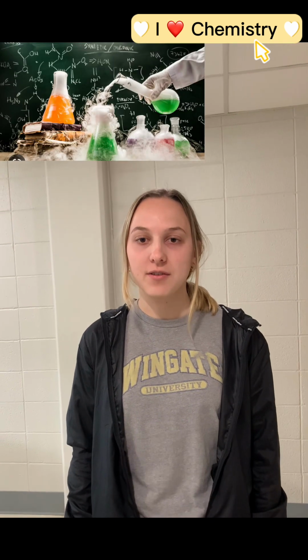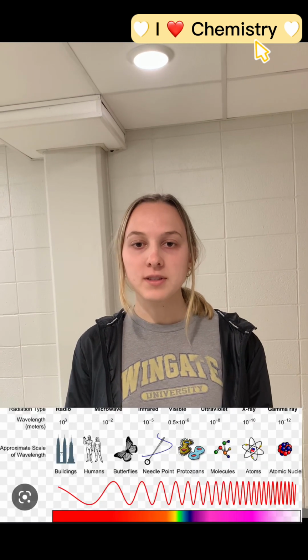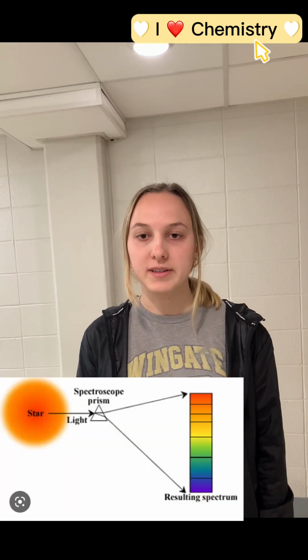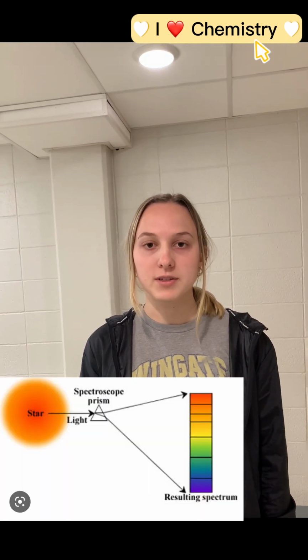with physical and analytical chemistry to detect, determine, or quantify the molecular or structural composition of a sample. Since light holds information about the materials found in objects, spectroscopes can be used to separate visible white light into a pattern of wavelengths that represent what the object absorbs, emits, or reflects.